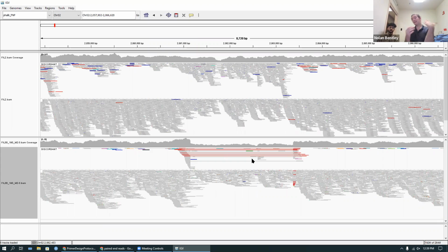And so what you'll find is it's not uncommon for mutations to be associated with a second mutation, especially big structural variants. So I have seen a locus where there was a deletion on one side of the chromosome, and it looks like maybe an inversion on the other side. And so what I would see here is that there were two stacks, with an inversion and with these deletion events. And so this is just a nice way of organizing.